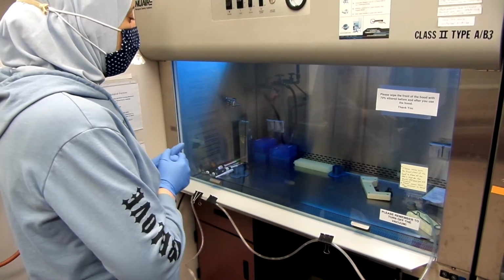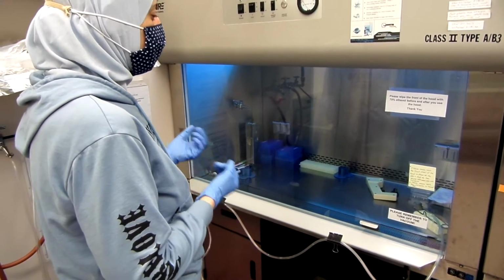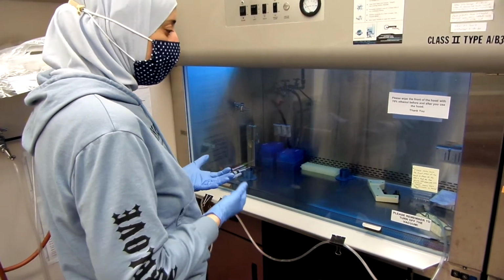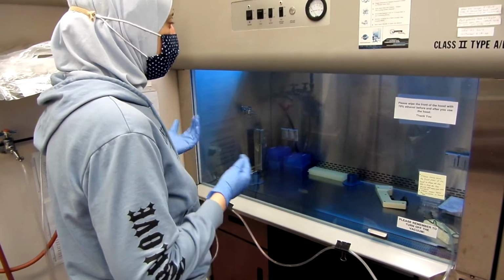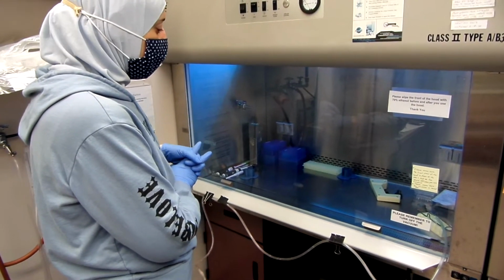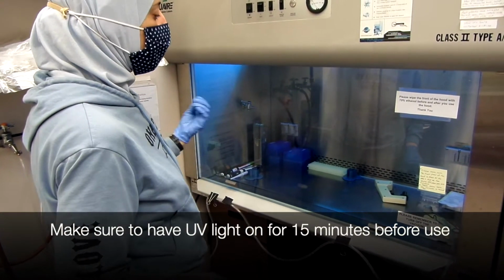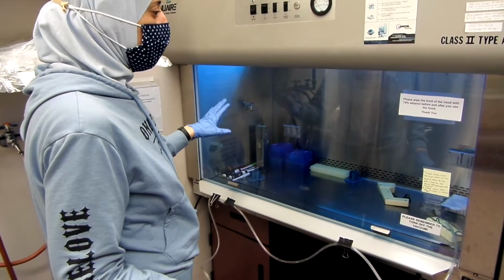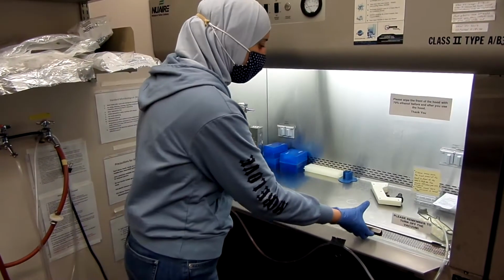Anybody who works with cells, whether they are primary cells or cancer cells or cell lines, needs to split cells or passage them, or place them in different plates or dishes. One thing you need to make sure of is that your biosafety cabinet has the UV on for at least 15 minutes before you start. As you can see, the UV has been on for at least 15 minutes. So we'll start passaging cells or splitting cells.